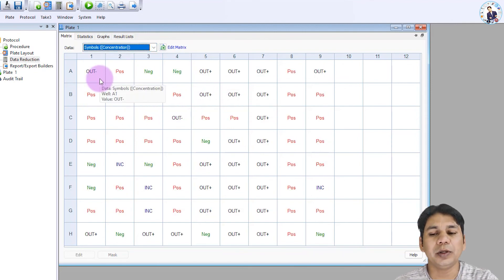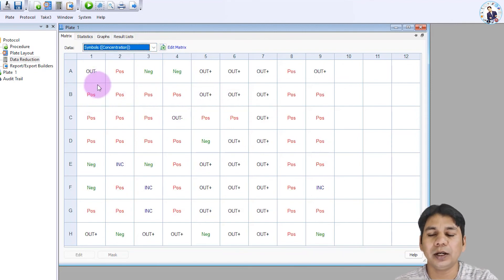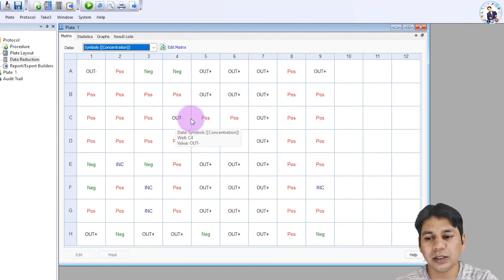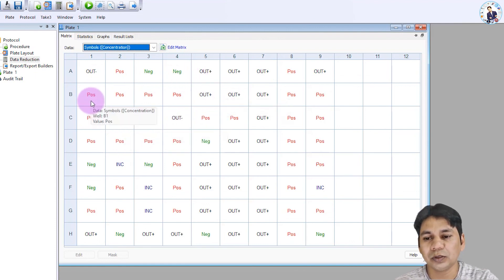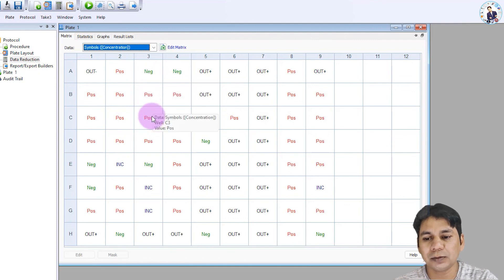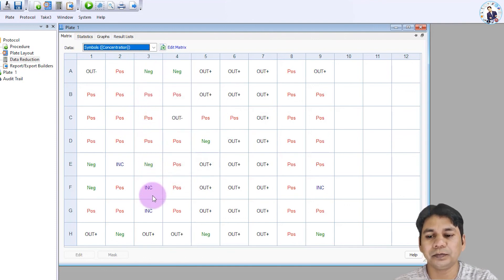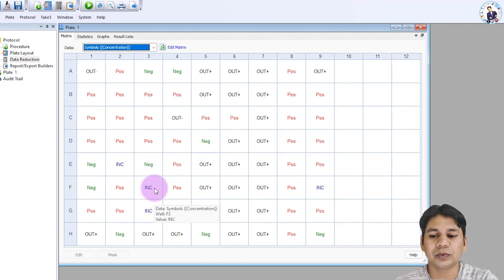On the basis of the cutoff setup, the software assigns the result for each well. You can see the results: some wells are negative, some are positive samples, and some samples are inconclusive.